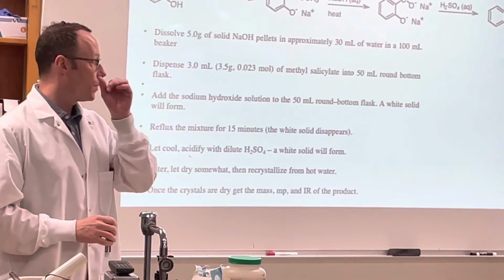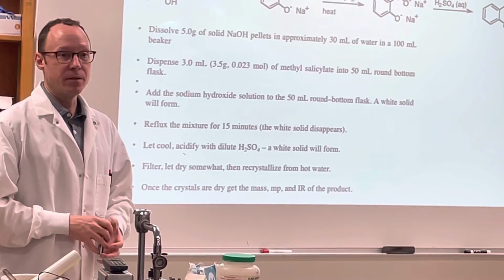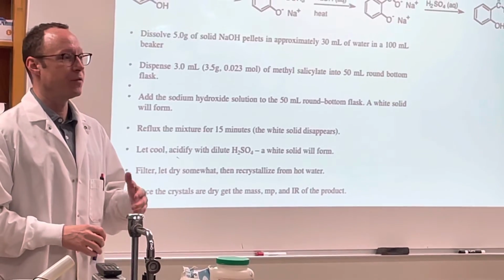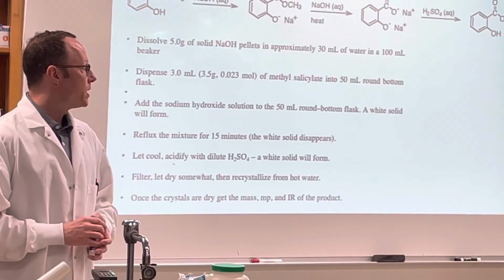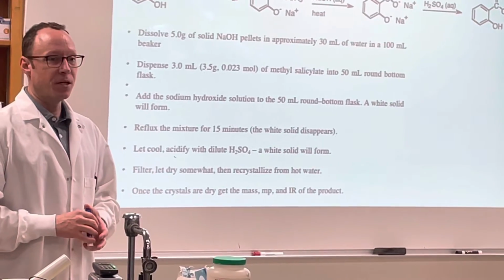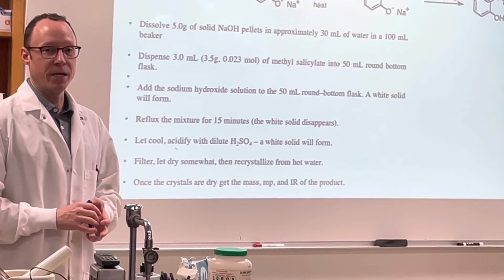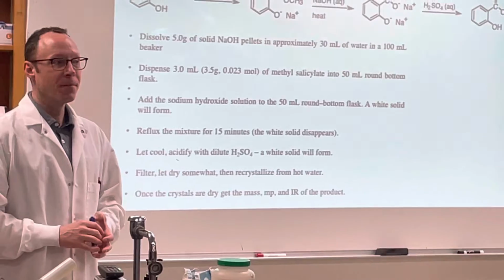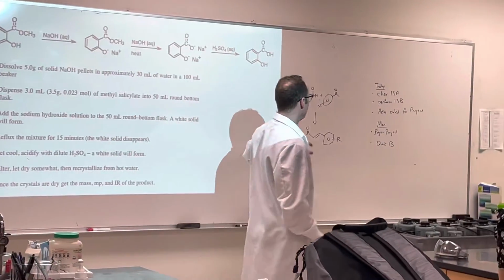All of those chalcones, because they are differentially substituted, are not going to behave the same, in terms of solubilities, in terms of your purification strategies, etc. And so everyone's going to run into their own unique issues that you will have to figure out a way to overcome.